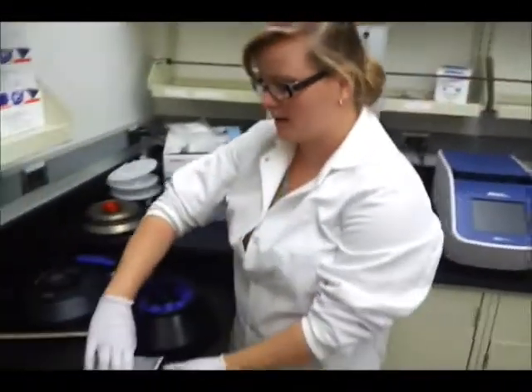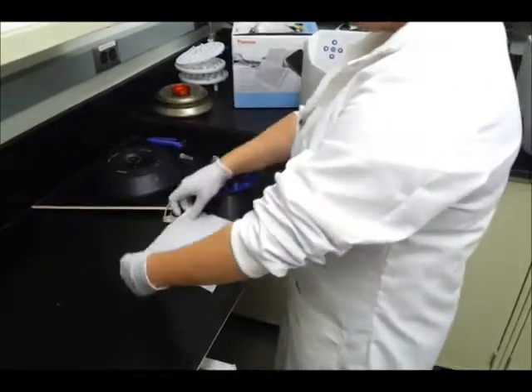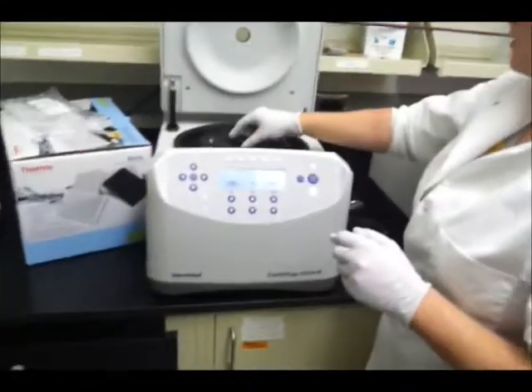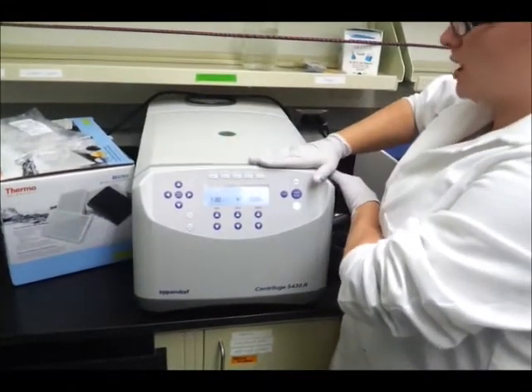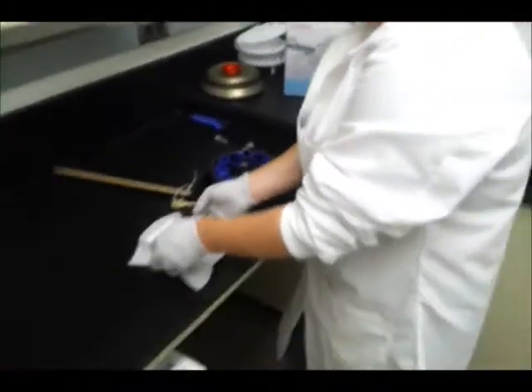So I'm going to put it back into the secure thing. No other technical name for it. Cover with Kimwipe. When you turn this guy off, put the cover back on. If you feel so compelled to change the rotor back, great, but the rotor gets changed pretty often, so and then turn that off, and we will walk back to the lab.